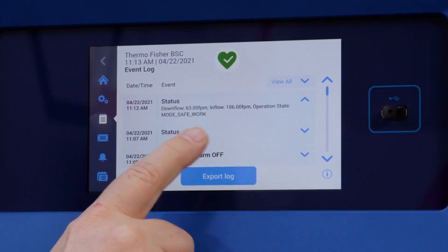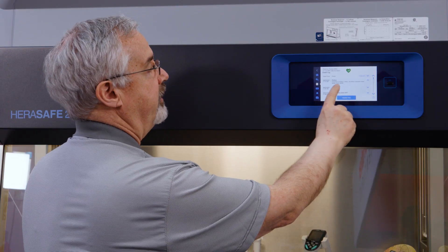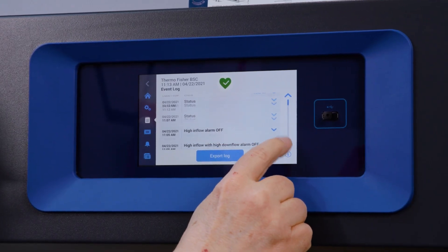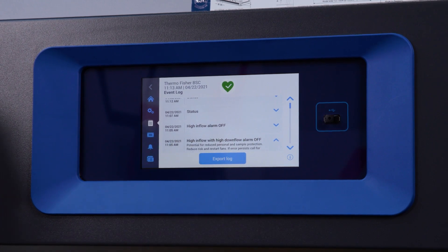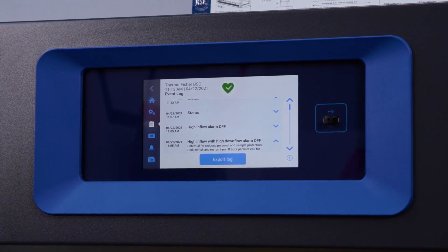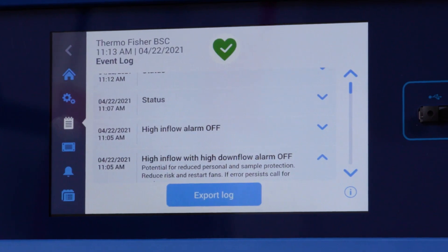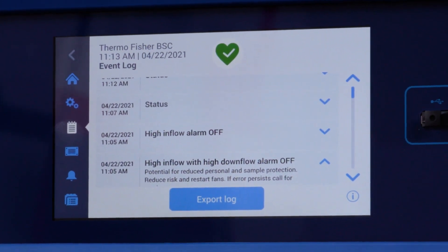One minute ago we had downflow at 63 feet per minute, inflow at 106 feet per minute, and the operational state was in safe working mode. Back when I had the alarms at 11:05, I had a high inflow with a high downflow alarm. It also gives you a reproduction of that ticker message showing what's going on and recommending actions for the user to take.